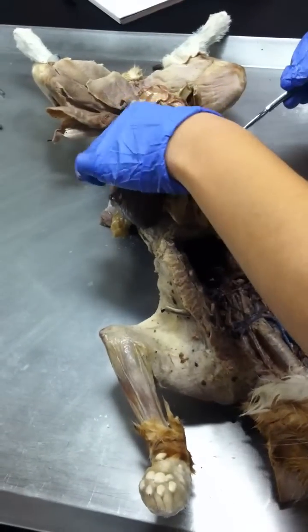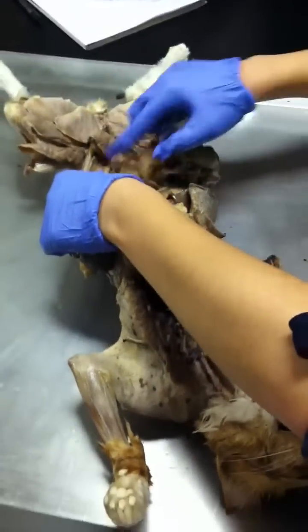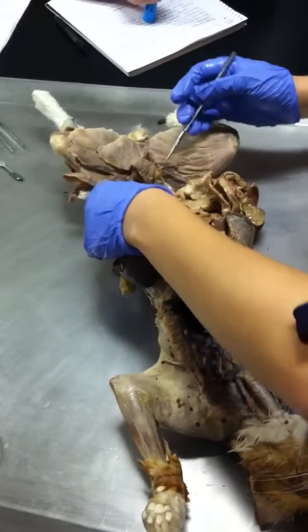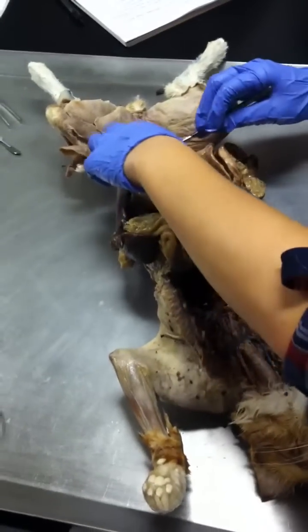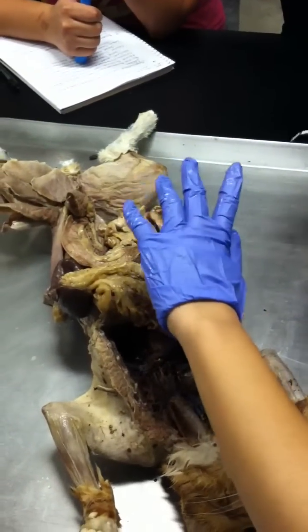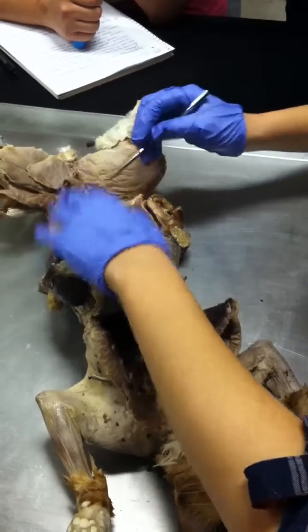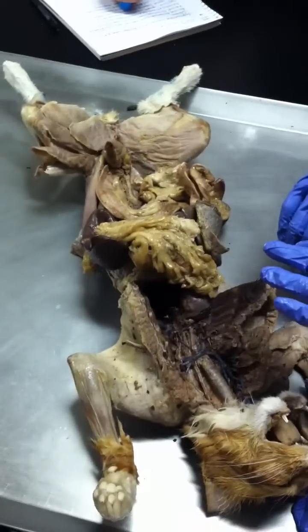Okay. Ascending colon, transverse colon, descending colon. Descending colon. Sigmoid colon. And the sigmoid colon, remember, it's a little S shape. It was pretty deep and it's very difficult to see. More likely, you guys will see that on the models versus the cat. Okay. And same thing with the rectum, and the anus is just an opening. So we went through the entire tube, right?